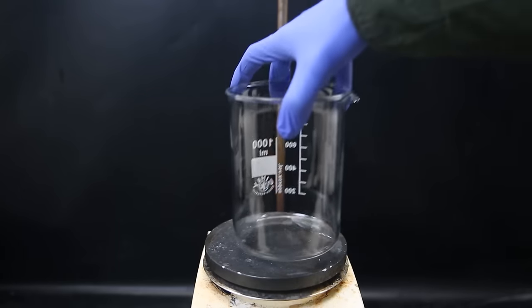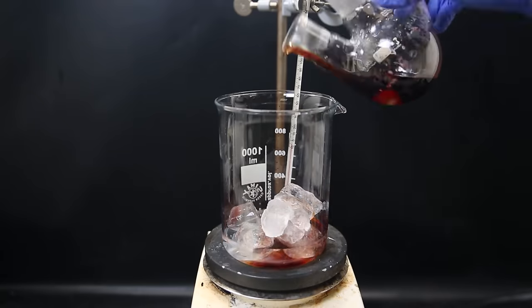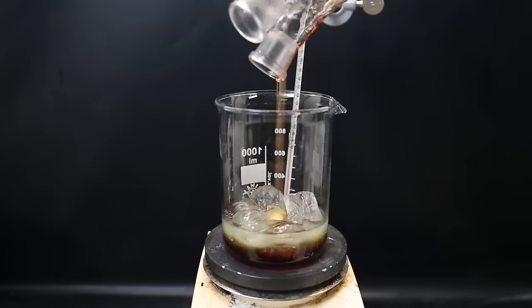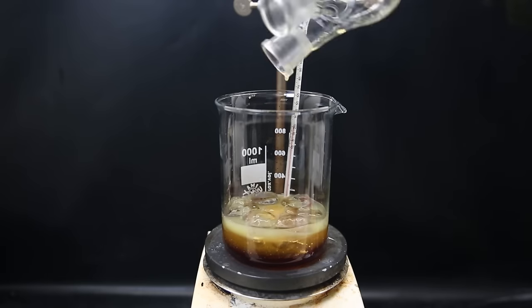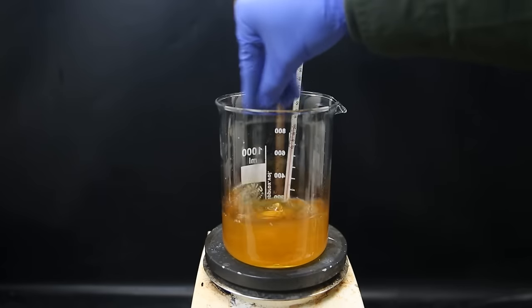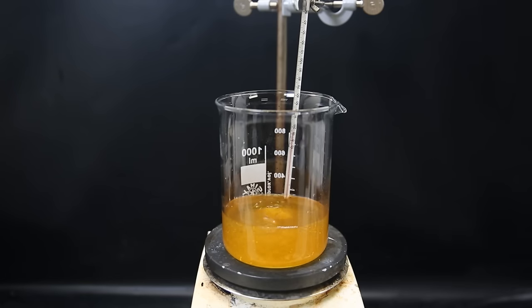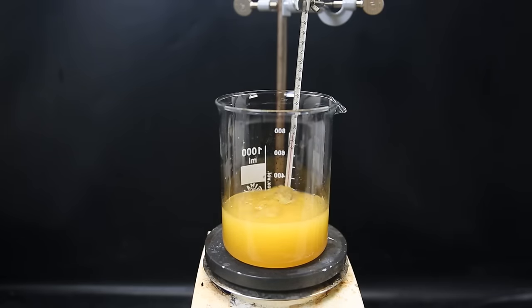I then set up a large beaker with a thermometer and some ice water. I pour all of the red mixture onto the ice to dilute it and keep it cool, because diluting sulfuric acid with water generates heat. I wash out the flask with some more water and stir the icy mixture. The red color disappears, and it keeps becoming lighter from precipitating solids. I left it for a few minutes, and it has become a thick yellow sludge.